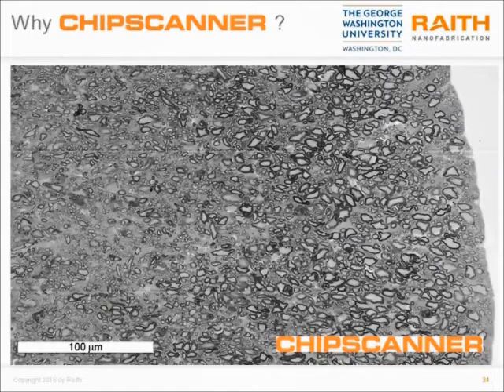And so here we used 100 micron fields of view that already had corrections built in, and the laser interferometer stage of the chip scanner, and we stitched together many such images of the mouse spinal cord. So here you see the axon cross sections, these circles. They're myelinated, so you can even resolve the myelin sheaths in this image. And you can even see some of the stitching boundaries.